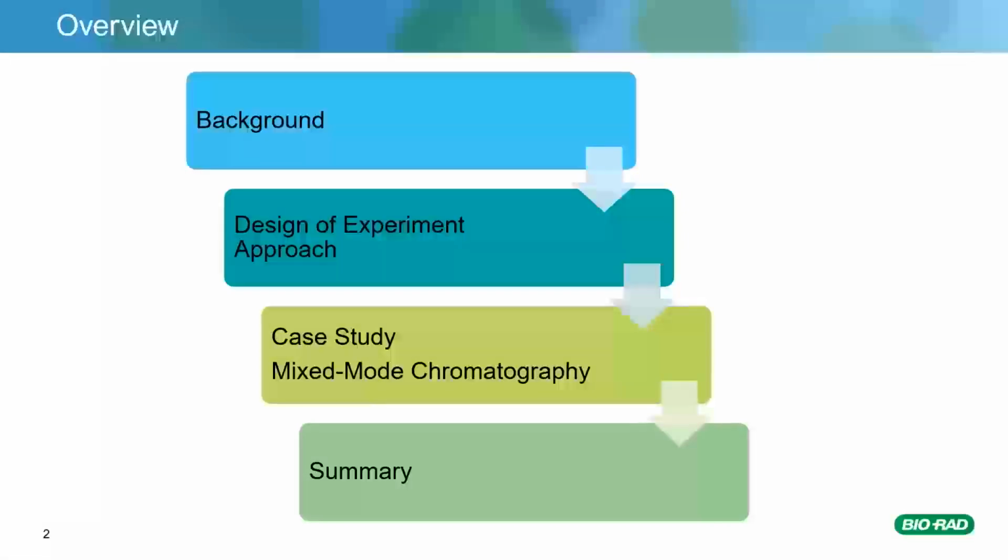I will also briefly discuss various mAb purification workflows that are used in biopharma production. In the next part of my presentation, I will show you two examples of the mAb purification using mixed-mode resins and the importance of implementing DOE approach to speed up your process development and maximize the process performance.